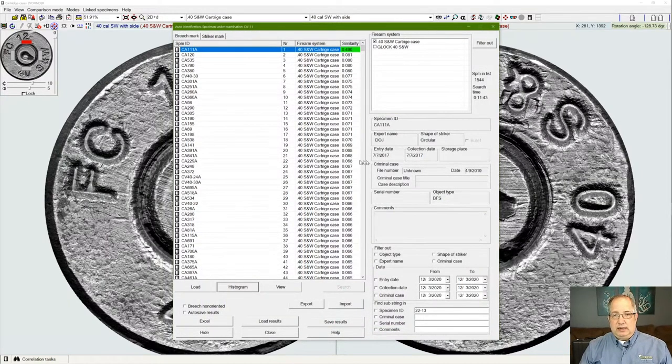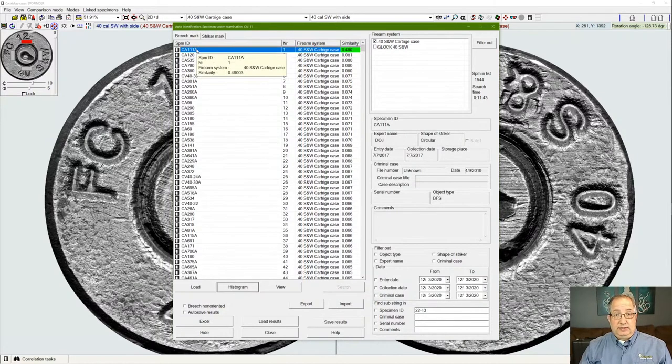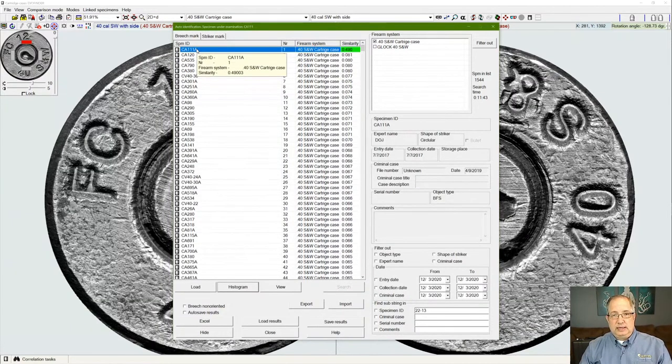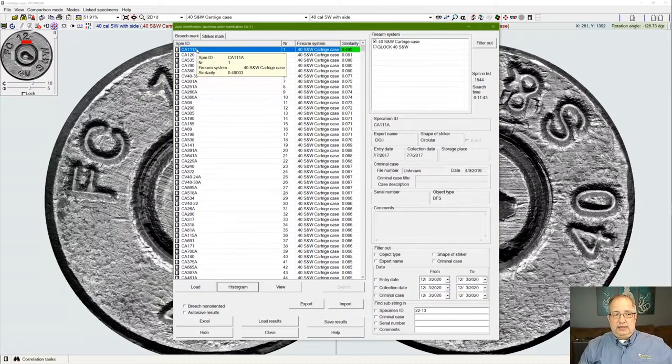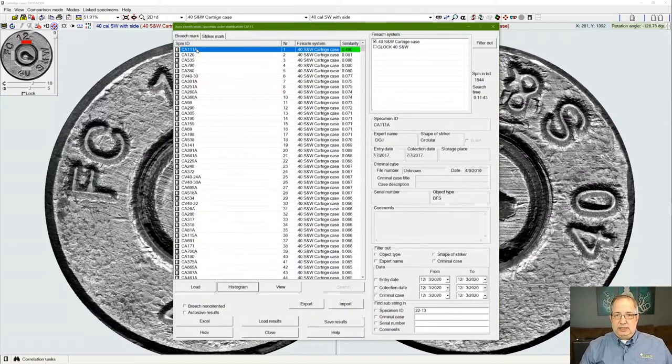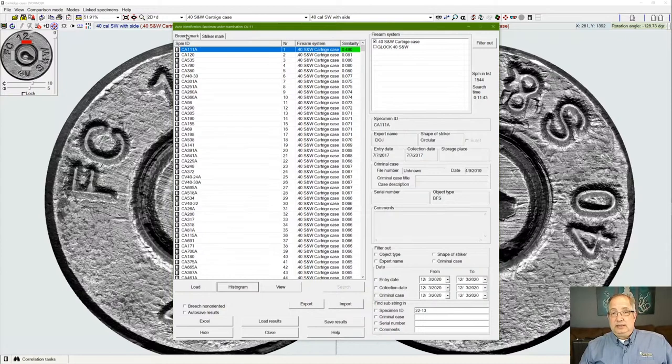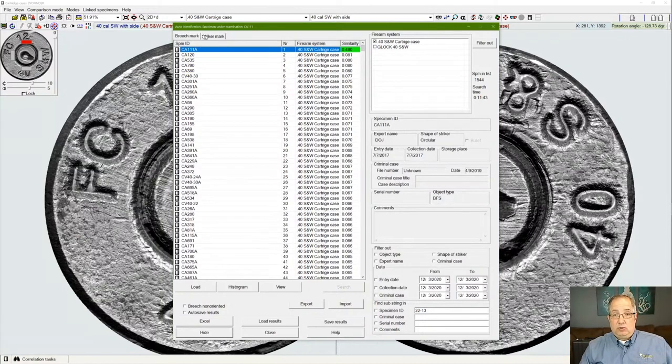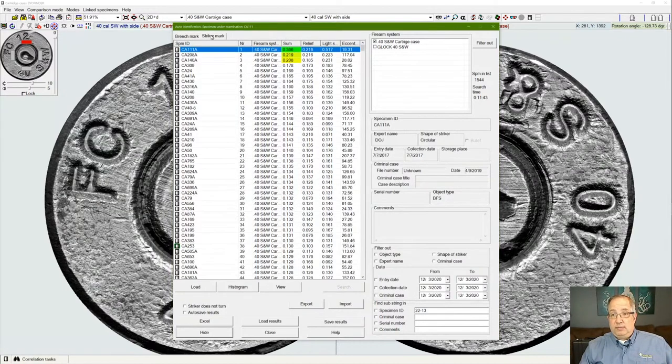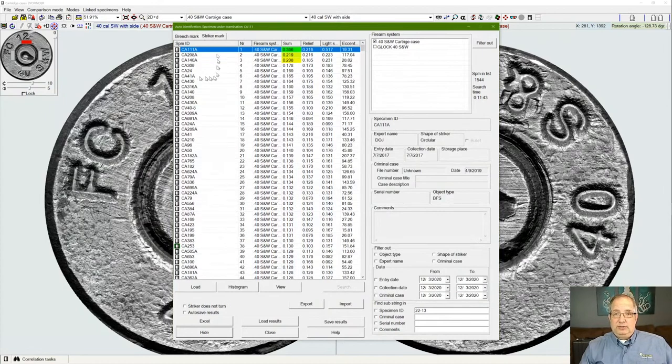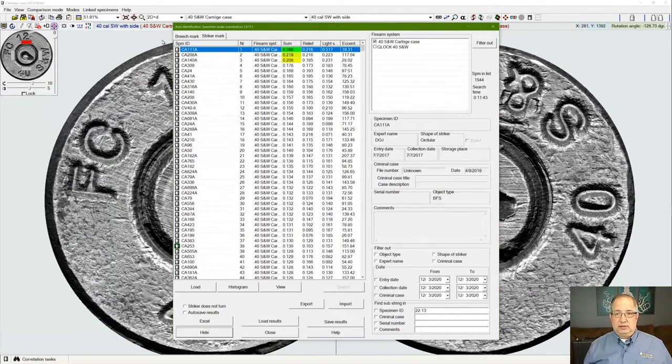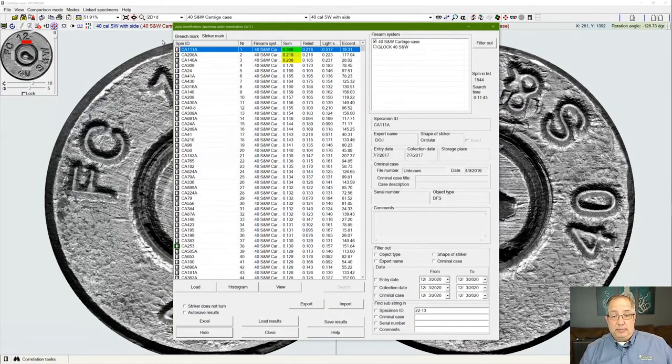Once we have this set up, the software will allow us to either preview the marks on these samples or load them and align them in a way that it calculates to have the greatest similarity between the two samples. We can see the ranking of similarity based on our breach impression or from our striker mark, so we have two different rankings within the list to be able to look for this evaluation of possible match.